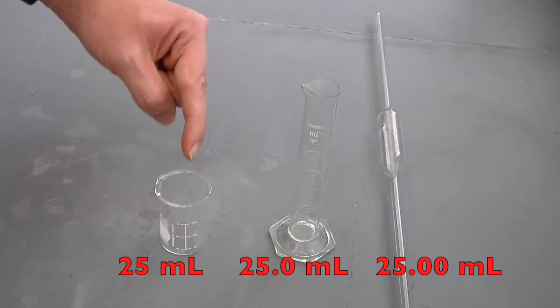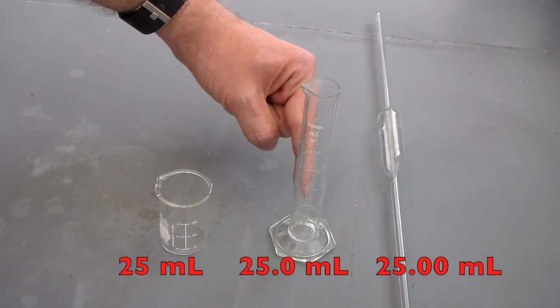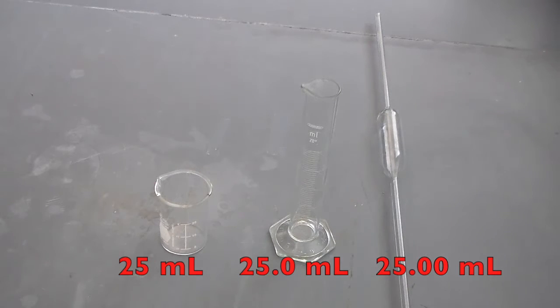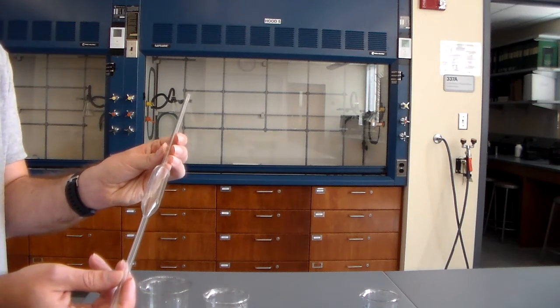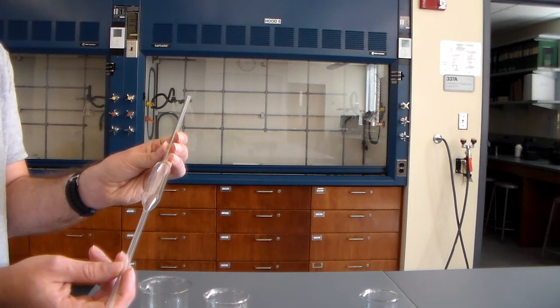So the difference here is the beaker only gives us 2 significant figures, the graduated cylinder gives us 3 significant figures, and the volumetric pipette will give us 4 significant figures. So to get the most accurate and precise reading possible, we'll be learning how to use the volumetric pipette correctly today. The first thing when getting your volumetric pipette is to clean it with water, because you do not know what contaminants are on the inside.